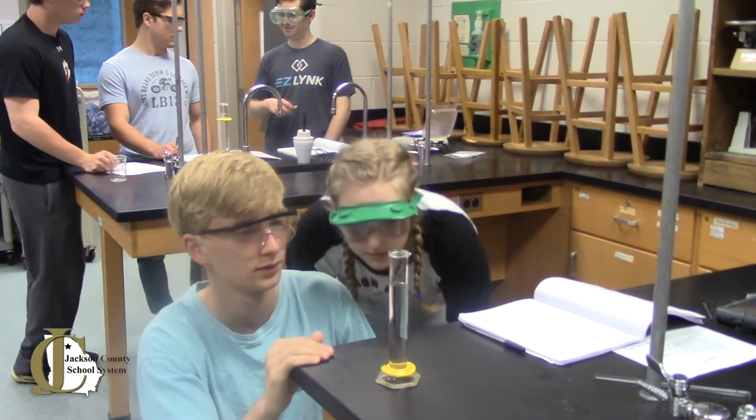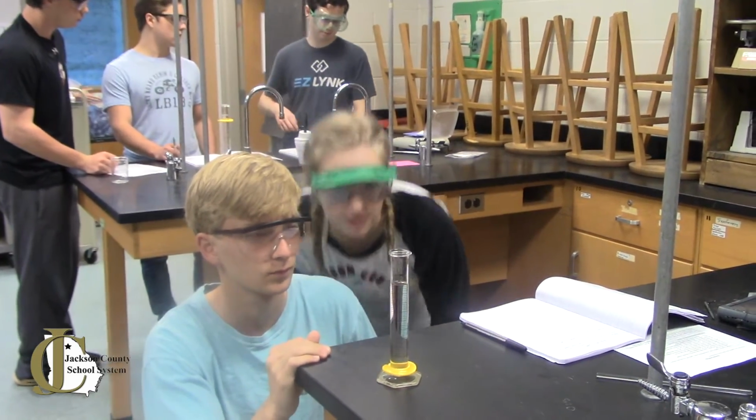It's not really at the meniscus, so maybe we should add.